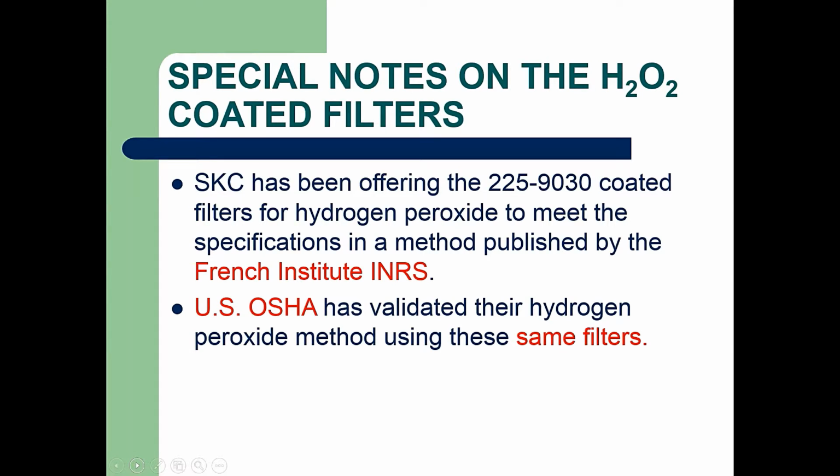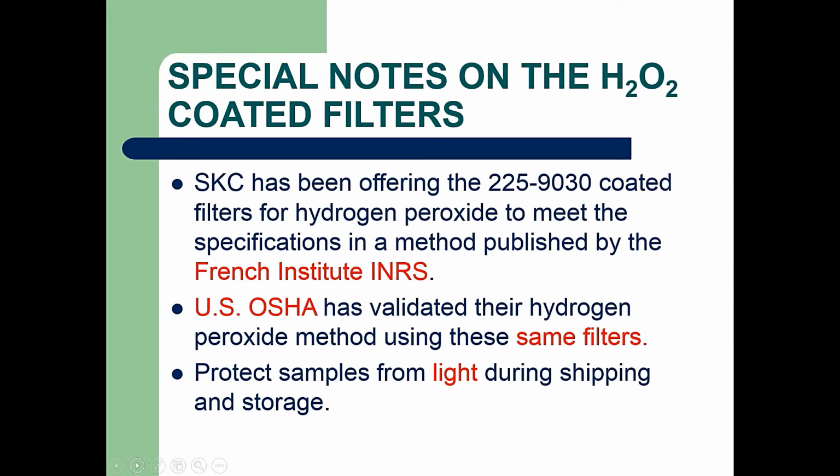What is new today is that U.S. OSHA has now validated a method using these very same filters. Finally, a special note, be sure to protect the samples from light during shipping and storage. SKC supplies foil with the filters for this purpose.